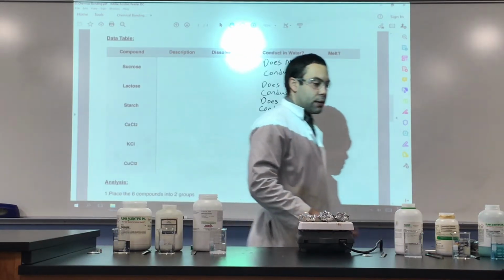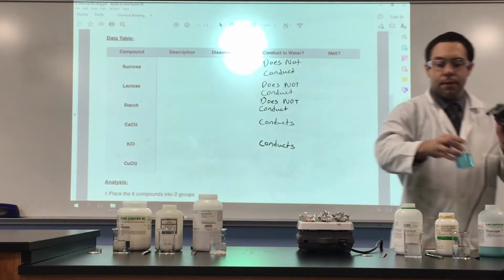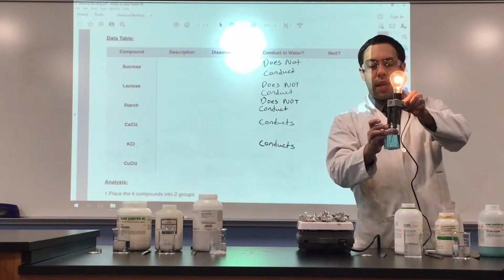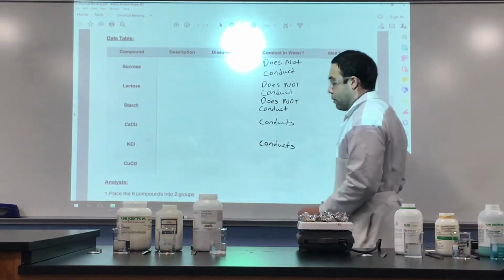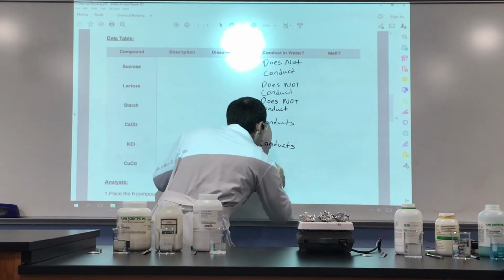Last but not least, the copper chloride, blue solution. Put the electrodes in, the light bulb goes on. It does conduct electricity. Conducts.